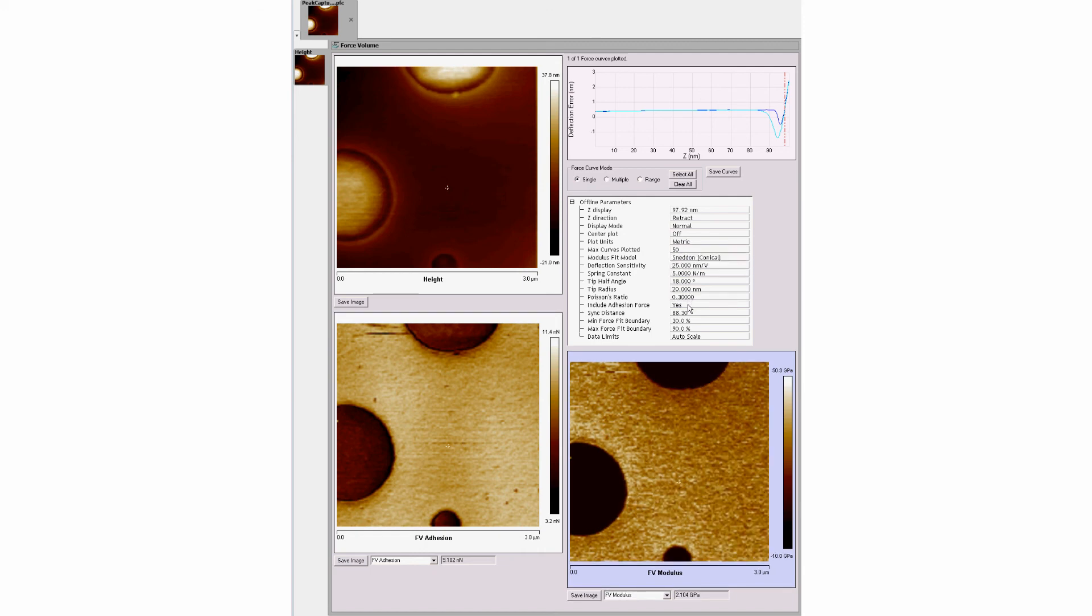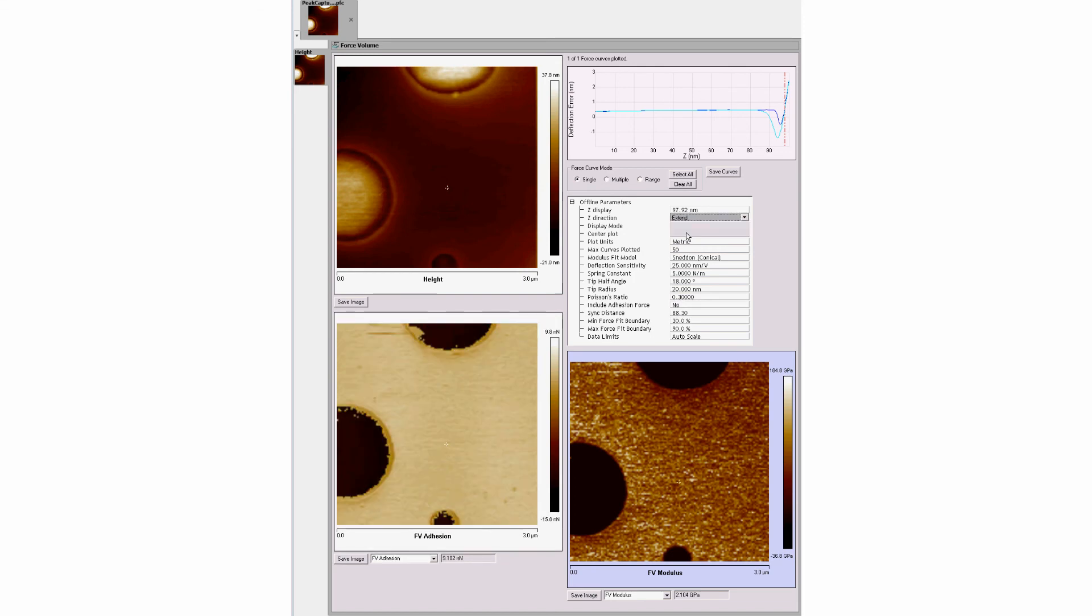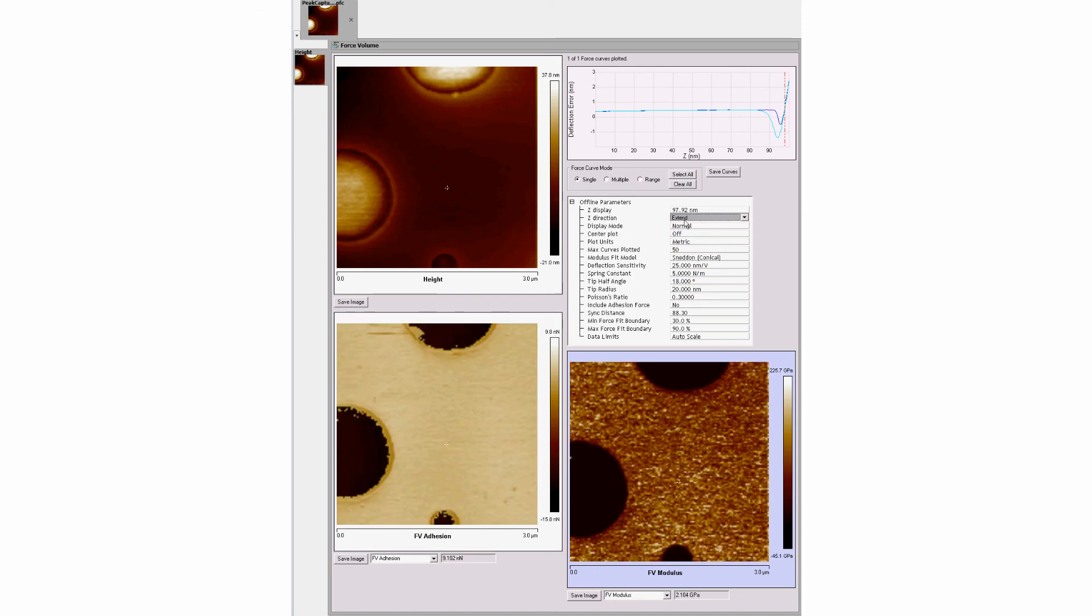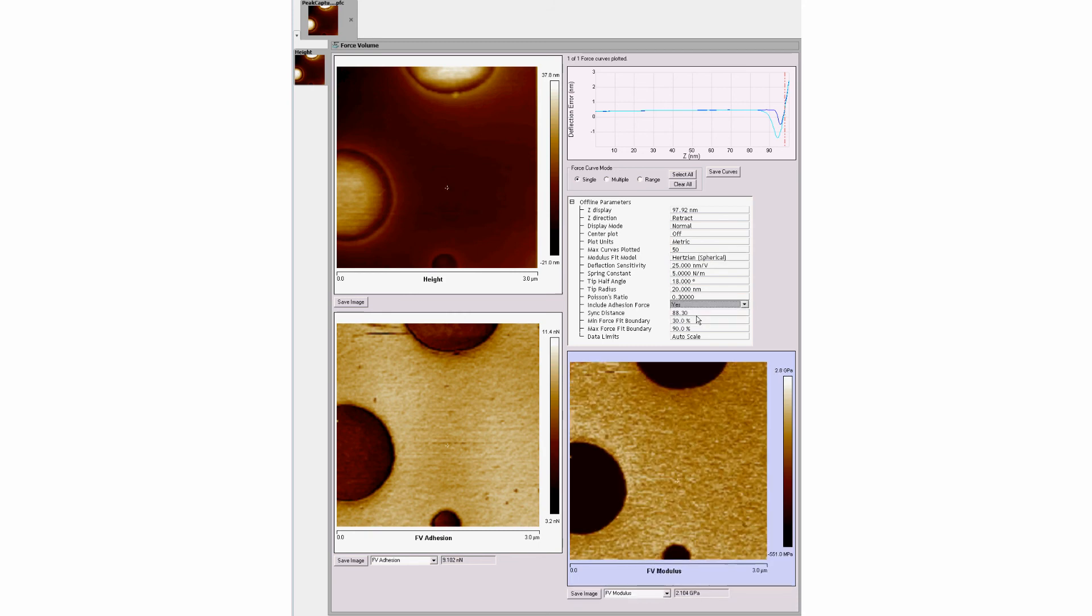The user may also decide to include or exclude adhesion data or to limit the display to the extension or retraction portion of each curve, as well as changing the minimum and maximum boundaries of the force curves.